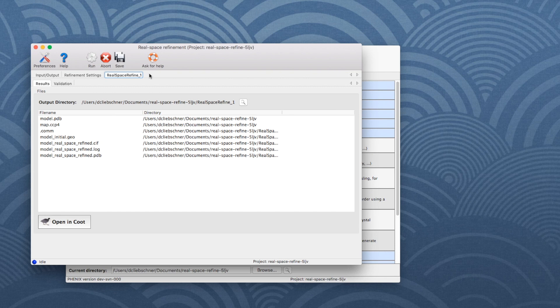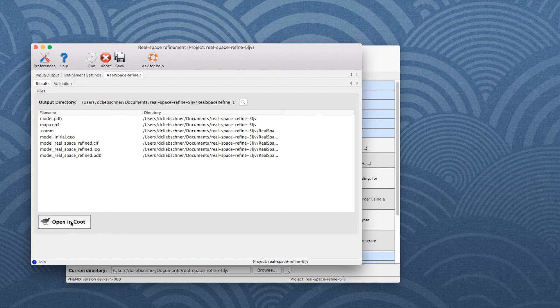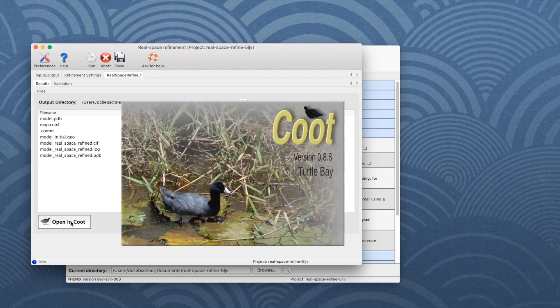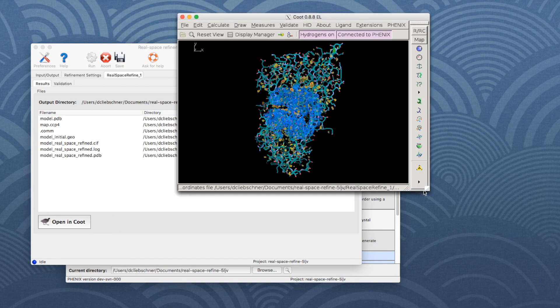The Results tab contains the list of output files. Click the Open in Coot button to see the map and the final model.